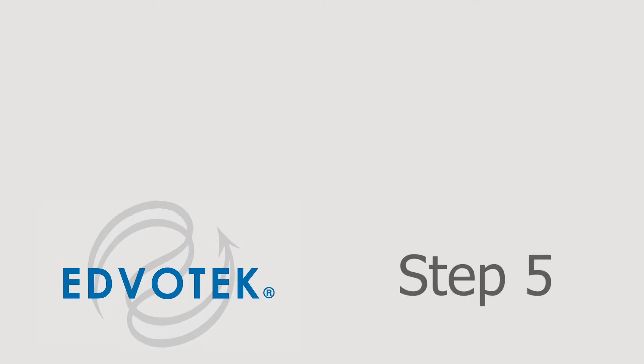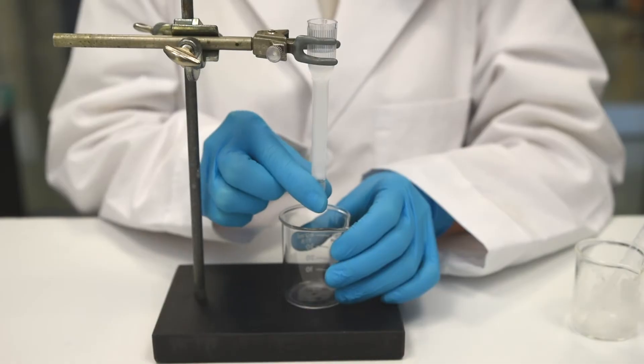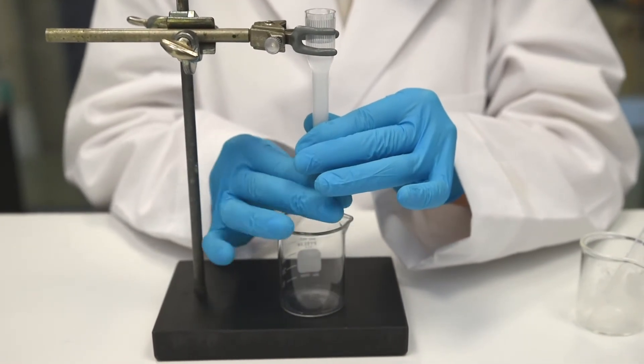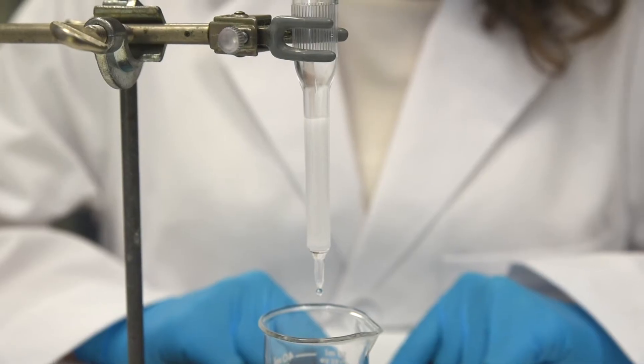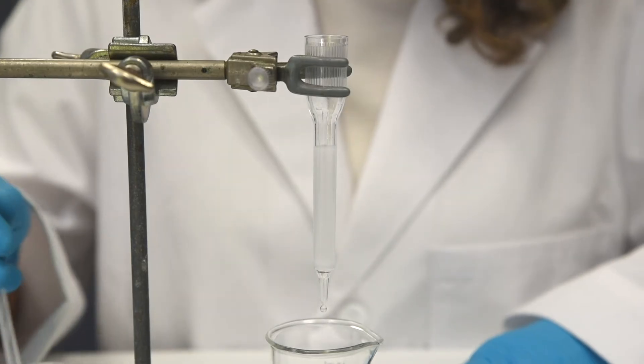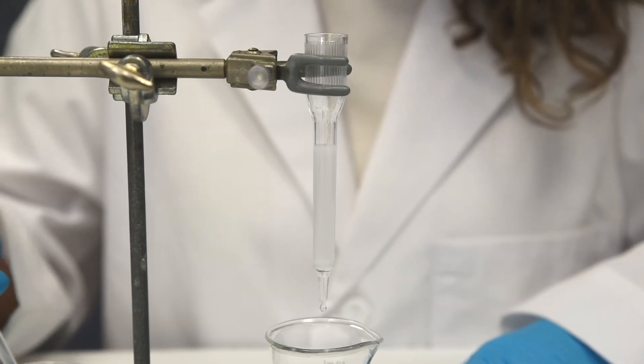Step 5: Place an empty beaker underneath the column to collect waste. Remove the cap from the bottom of the column and allow the matrix to pack into the column. The matrix should fill approximately two-thirds of the narrow part of the column.